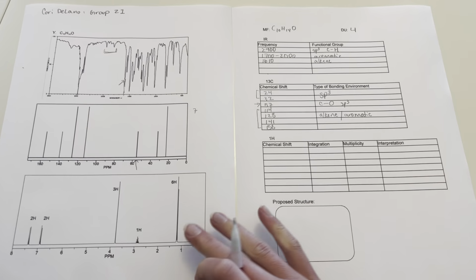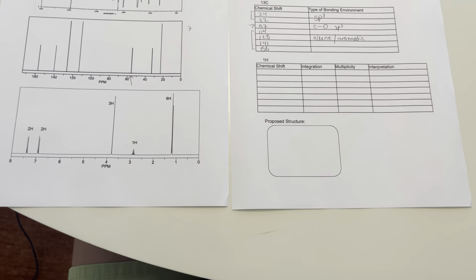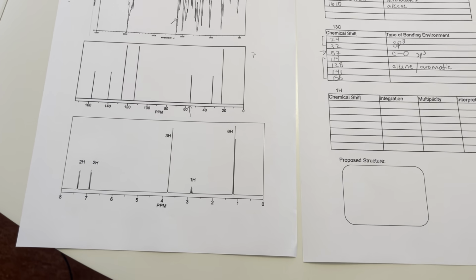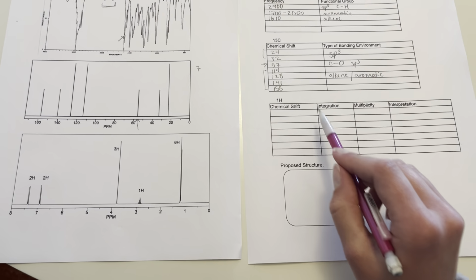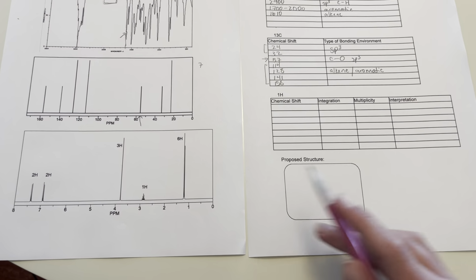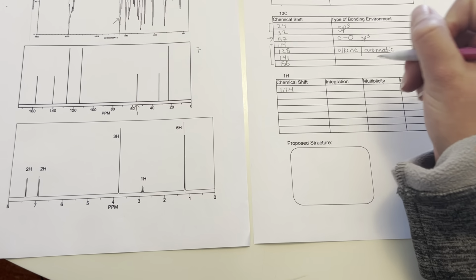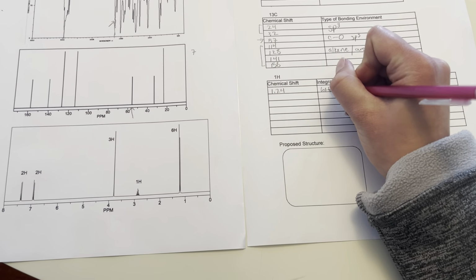Okay, finally we can go on to the last step. There are 1, 2, 3, 4, 5 peaks here, so let's figure out their chemical shifts, integration and multiplicity. The first one is approximately 1.24, and that is a 6H.